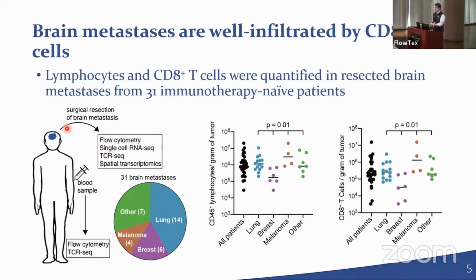We also did a very small flow cytometry panel directly out of the patient so we could quantify the number of T cells and other immune cells that were in the patient. We did that without washing. The staining is not the best, but you actually get an exact number of how many T cells or other cells were in that patient. And then we also did flow and TCR sequencing from the blood.